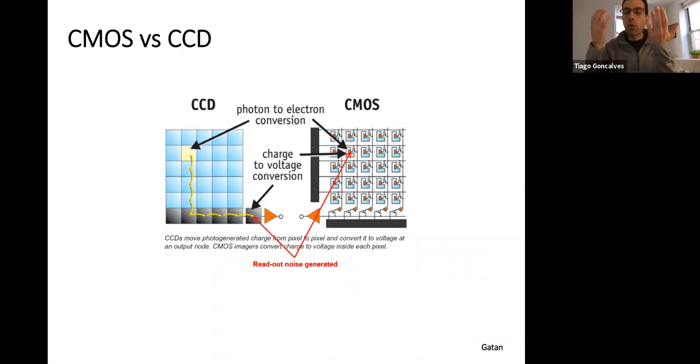They work a little bit like our eyes, like in the retina, where our sensors are actually below a lot of wiring, right? Your light goes through a lot of stuff to get to the actual rods and cones, to the active part. And in these cameras, it's a little bit the same. In front illuminated cameras, the readout mechanism, the electronics, is on top of the pixel. So it actually reduces the active area of the pixel that you use for capturing photons.